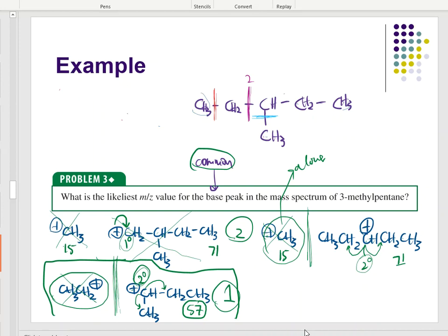And if it cleaves in this fashion, not only is this secondary, which is more stable really than the other fragments that we're seeing, with the exception of one, but the molecule says, if I cleave in this way, I'm also releasing a CH2CH3 piece, which is bigger than the CH3 option in that case. And I feel better about my people going out together to the bar versus alone to the bar. Who knows what will happen to them? So this option is going to be better for the molecule. And if it has to choose, the molecule will cleave at that spot.